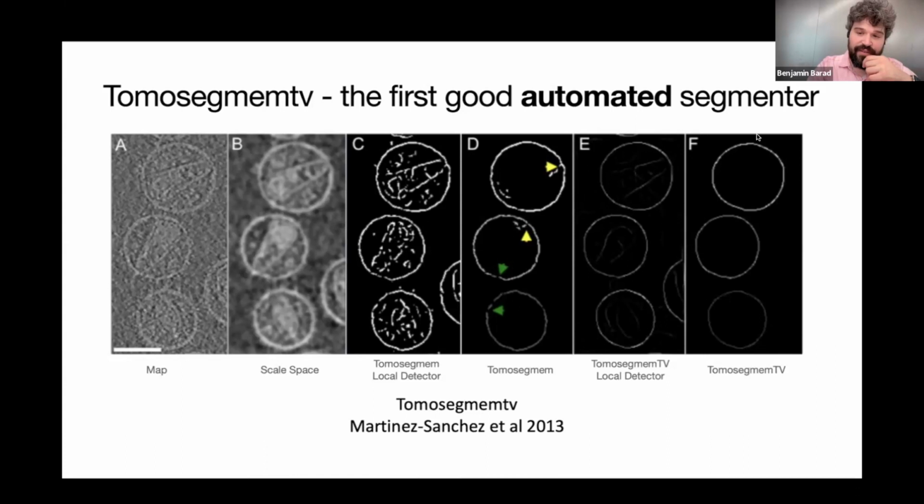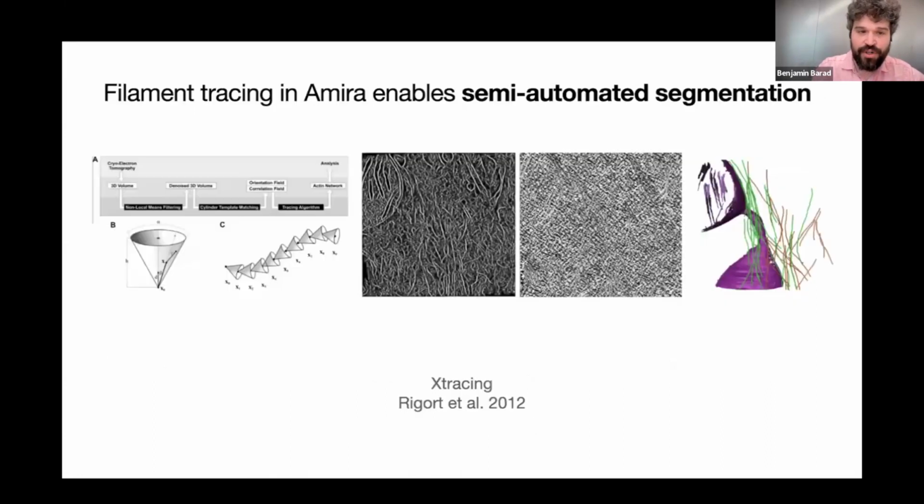It works beautifully for these kinds of very simple spherical membranes. For the highly curved cellular membranes we were looking at, the problem is that the assumption that these two have to be not super curved is bad when sometimes you have really tight curvature. And so it fails often to recover high curvature.